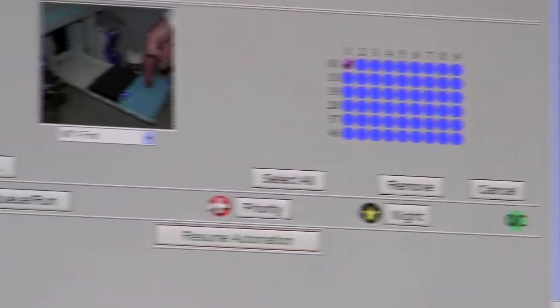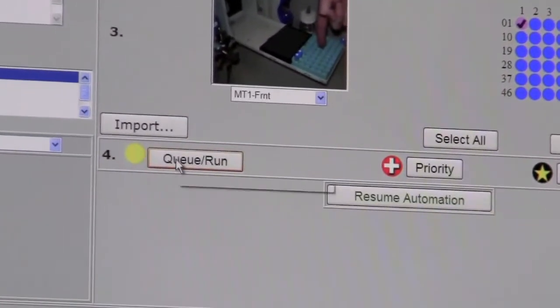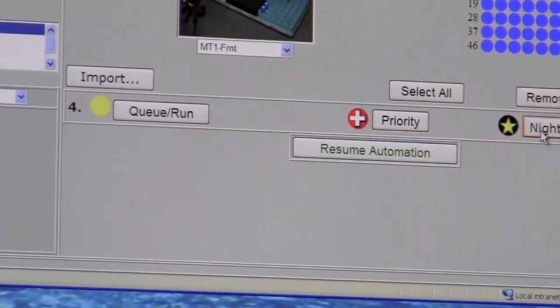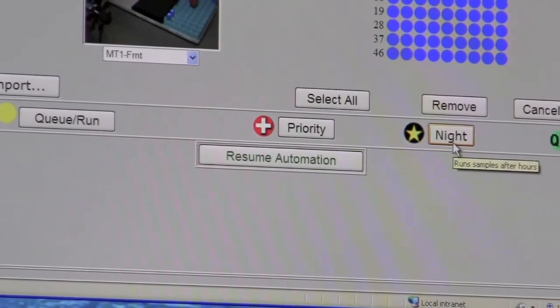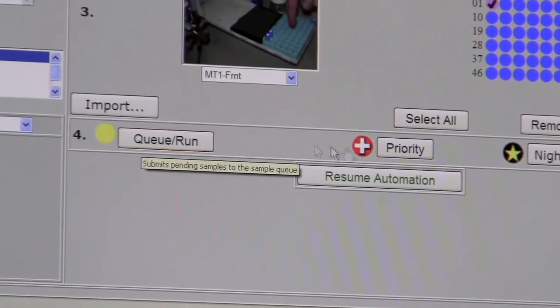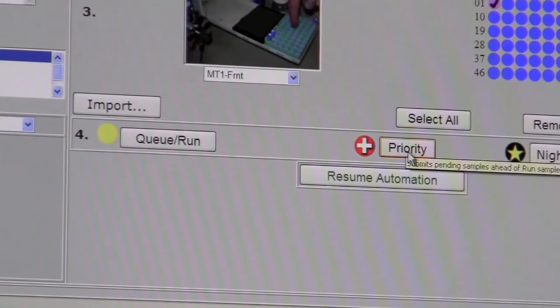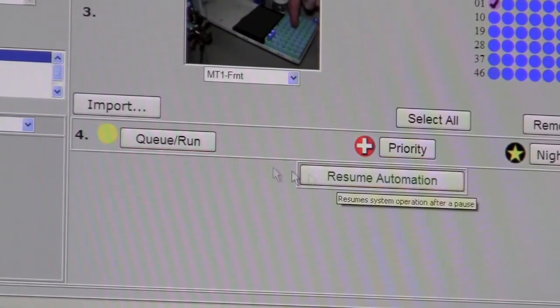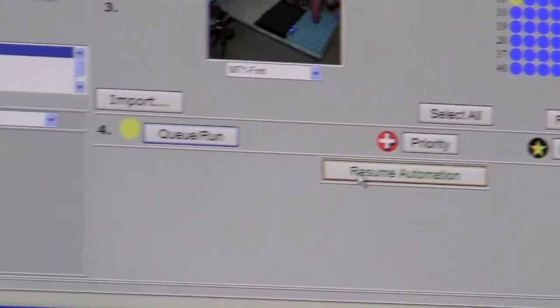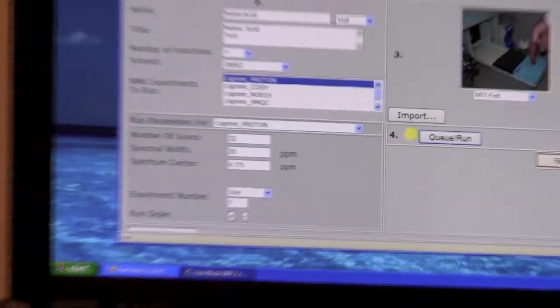Finally, we need to run the sample. There's three options. A standard run, a priority run if you have that privilege, and a nighttime run. Nighttime will wait until after midnight to run. A standard run will run as soon as possible, and a priority run will run before everything else if you have that privilege. So in this case, we will click on run, and then the sample will run.